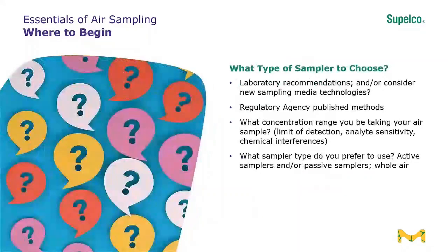And continuing on that, you have consulted and you are consulting with your laboratory partner or your environmental health and safety officer, industrial hygienist, or perhaps you contracted a service to help you on this journey. So the next part is the sample collection. You have an idea, you know where you want to look, but what devices am I going to use? How am I going to do it?